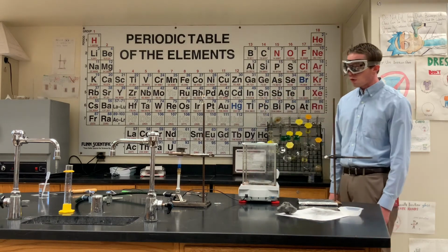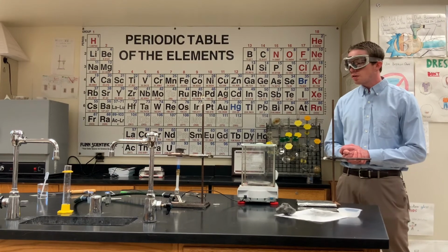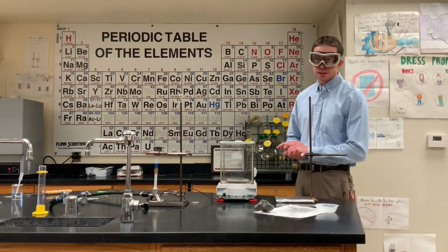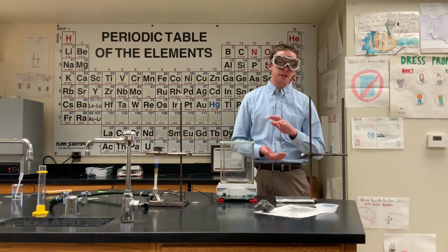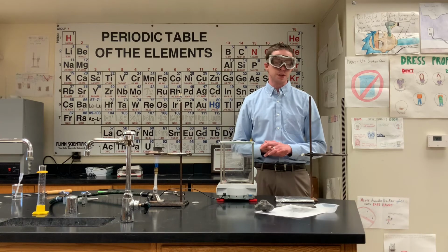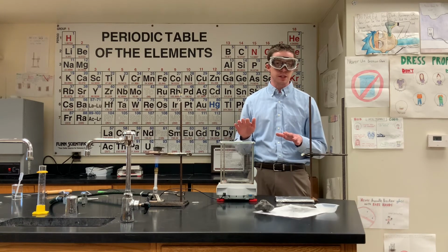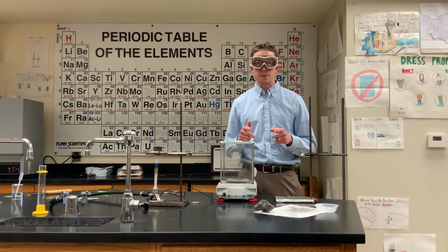Let this go for 2 to 3 minutes, and then we will let it cool back down and take a mass. After we take the mass the first time, we will pop it back on the heat for another 1 to 2 minutes, reheat it just to make sure all the water was completely gone and we get a consistent mass. And we will be back at you with that consistent mass when we've got it.